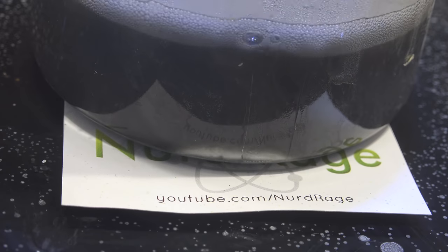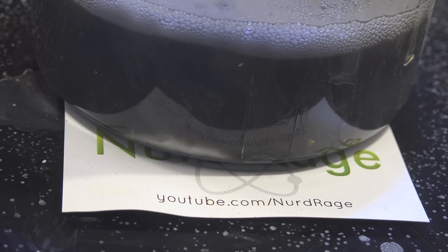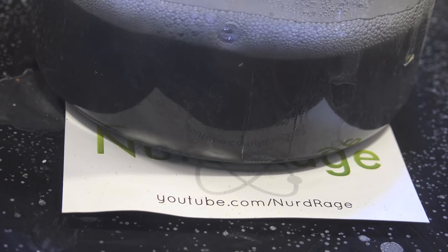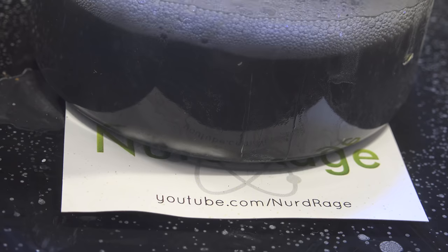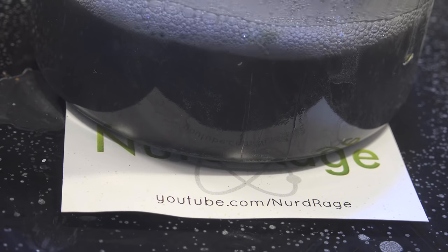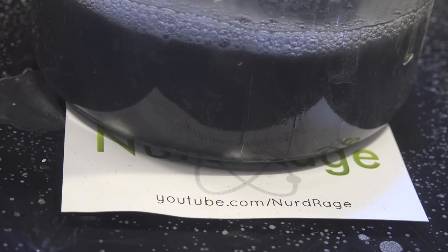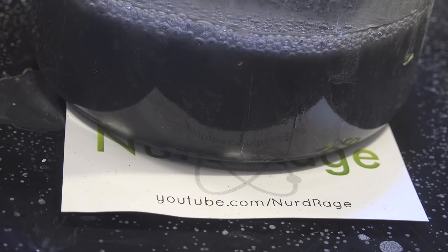Eventually, as the sodium aluminate and undissolved aluminum oxide particles build up, the reaction will slow down to a crawl. This takes about an hour. If the metal still hasn't liquefied by then, there's too much aluminum — you should refresh the reaction by pouring off the excess solution and adding more water and equivalent sodium hydroxide. You may also add in more gallium-infused aluminum if it's available.